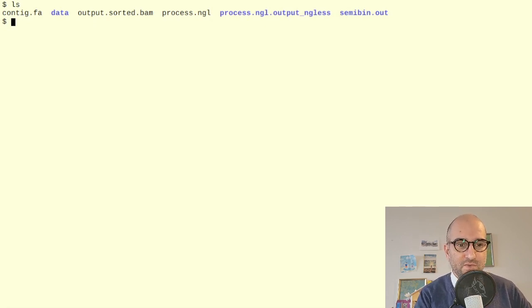Anyway, today we're not here to talk about the tribulations of parenting teenagers, but we're here to talk about our tool macrel, which finds antimicrobial peptides in basically anything. But here we'll be using metagenomics.